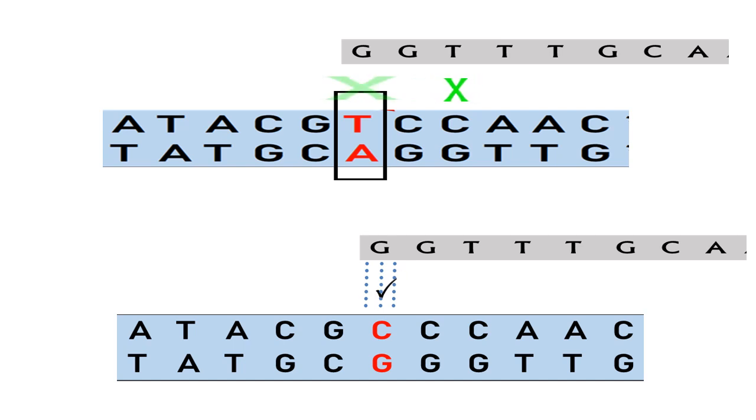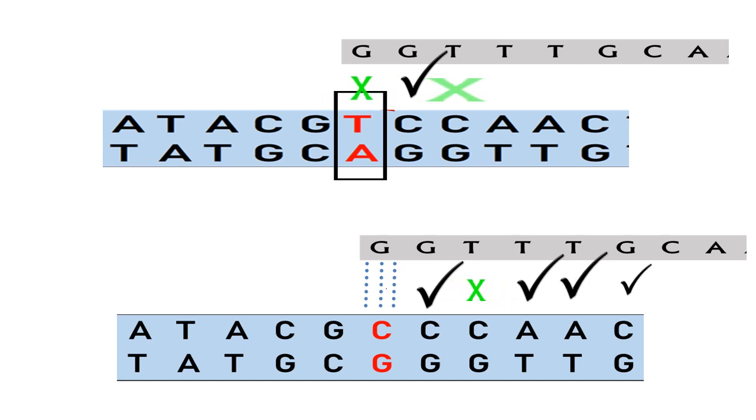Now we know that we introduce mismatch in the primers, in the inner primers. So in the first figure we see that the mismatch is not able to find a bond with C. T and C bond is not forming. And this is similar in the other primer as well, because this DNA sequence is similar at other points but is only different at the point having T and C allele differences. The other nucleotides are complementary and will bind accordingly. We can see, shown by the tick marks, that there are successful bonds between them.